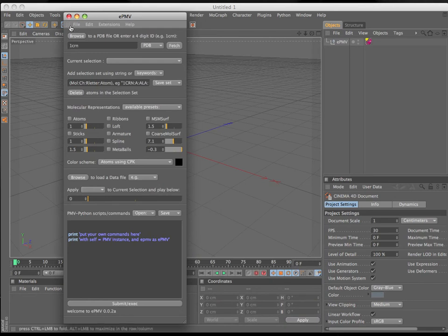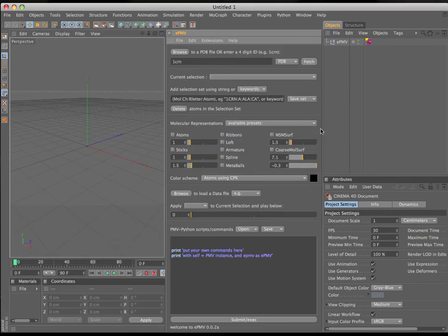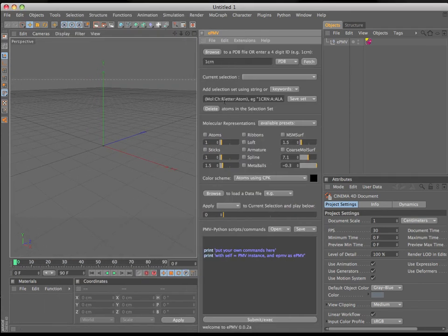I'm going to grab this little rough patch under the macOS closing dot and position EPMV into my interface to allow me to move in the limited amount of screen space I have available on this screen capture for this video.